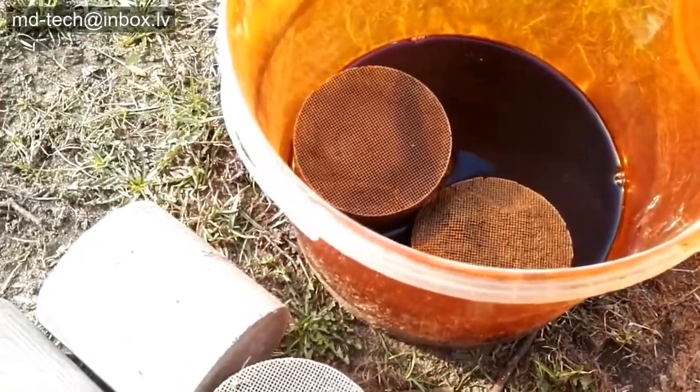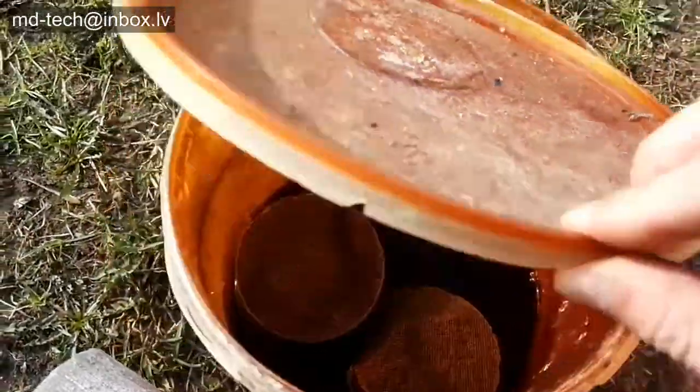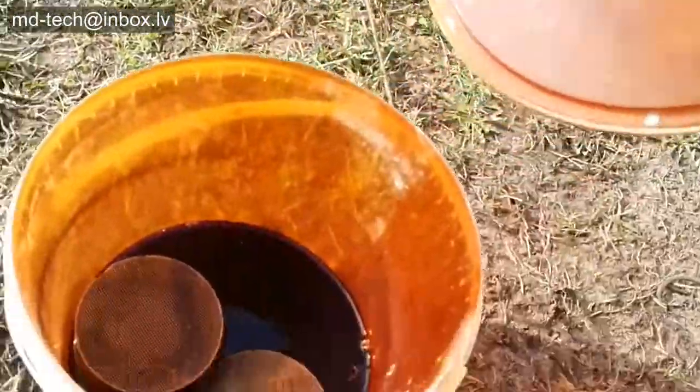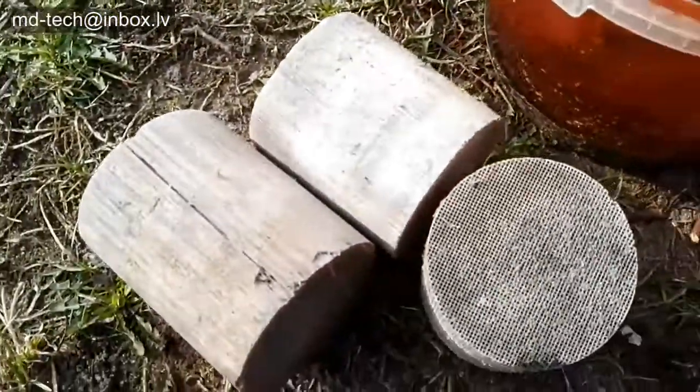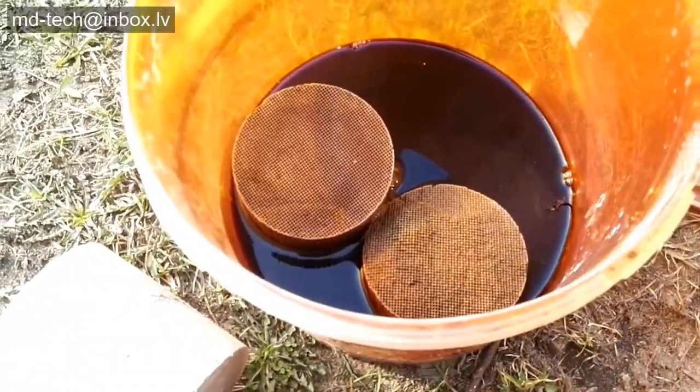Two weeks ago I made a strange experiment. First I made concentrated nitric acid, about 90%, and mixed it with concentrated hydrochloric acid, 4 to 1, and made aqua regia.